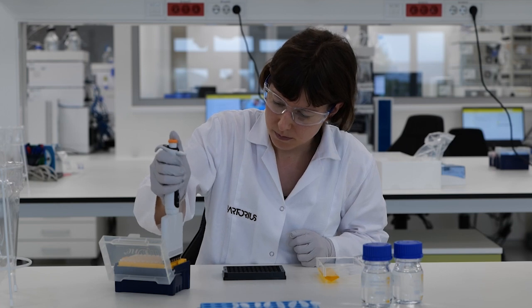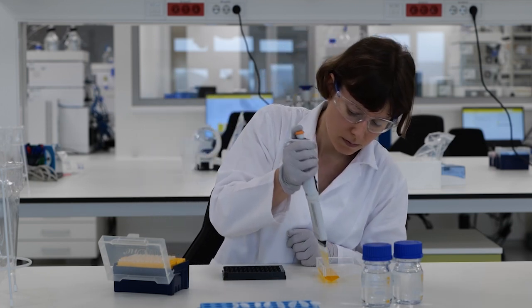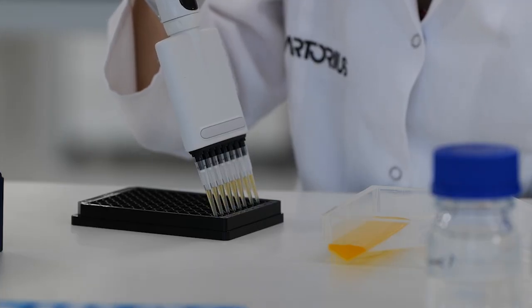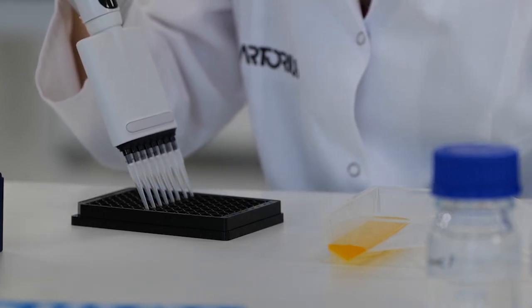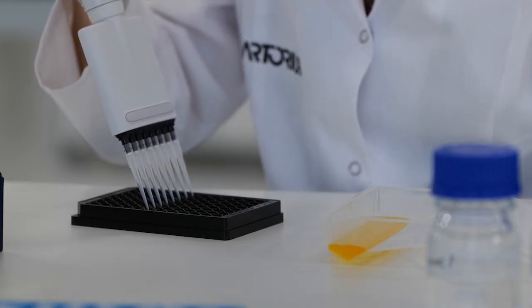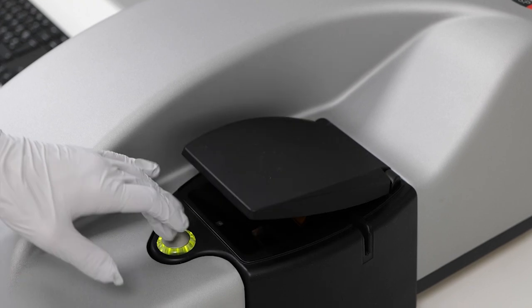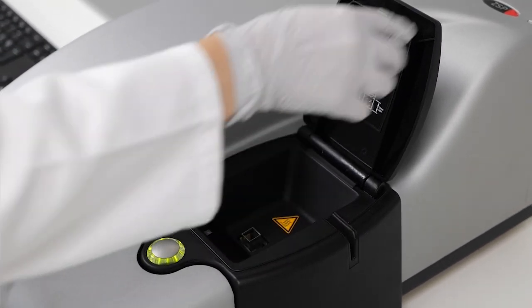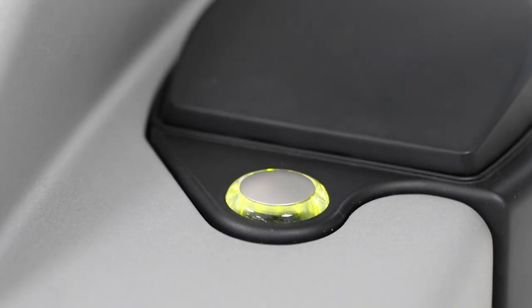This protocol is very time-consuming and labor-intensive, as it requires multiple steps of reagent addition, which increases the possibility of operator error. Furthermore, the ribogreen assay does not provide additional therapeutically relevant parameters, such as mRNA integrity, and is inadequate for detailed characterization of co-encapsulated nucleic acid payload. For size determination, another therapeutically relevant parameter, a separate analysis is required using different sample preparation and instrumentation, such as DLS, NTA, or microscopic techniques.